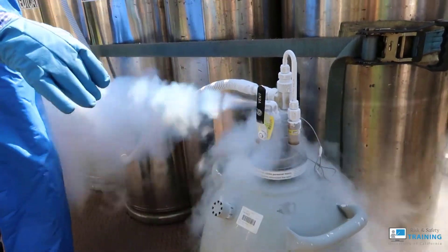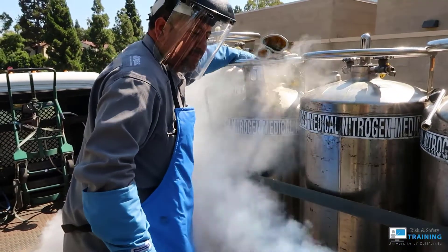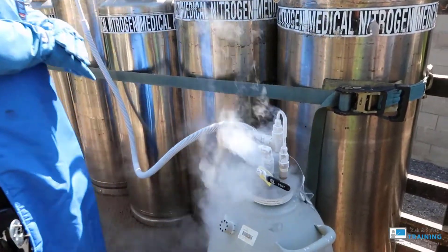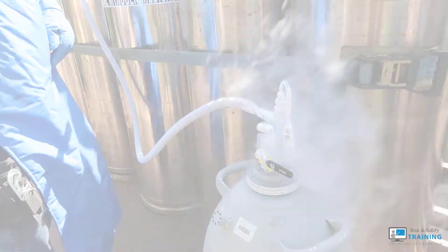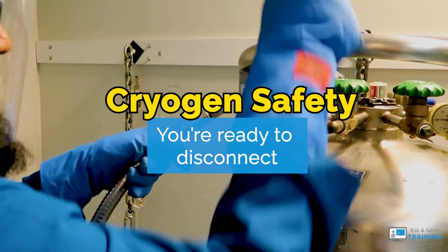In a closed container, the liquid will start to come out through the vent. Shut the vent off at the source, then close the valve on your container. From there, close the vent valve. Once your container is secured, work on disconnecting from the source.